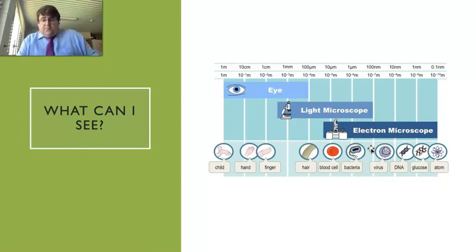We've got quite a few pathogens that we can look at under the microscopes when you come back to school, and you won't be able to see much. You can see some detail, but it's really hard to work out the individual cells.